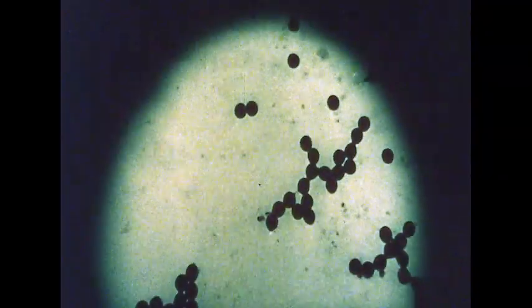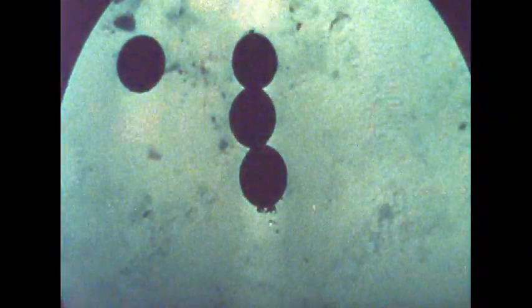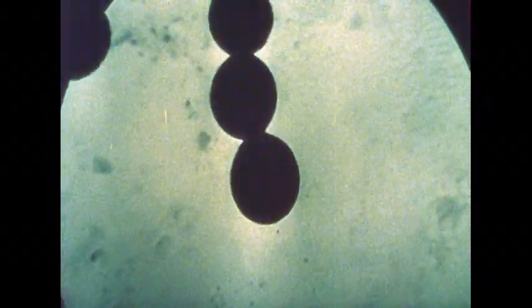At the lowest magnification, the squares of the specimen grid are visible. The operator selects one square. Already the latex particles can be seen sitting on the layer of carbon. At 20,000 times, magnification is changed to the higher range. We can see that spongy latex rubber is actually built up of very many small spherical particles, each about 1/1000th of a millimeter in diameter.